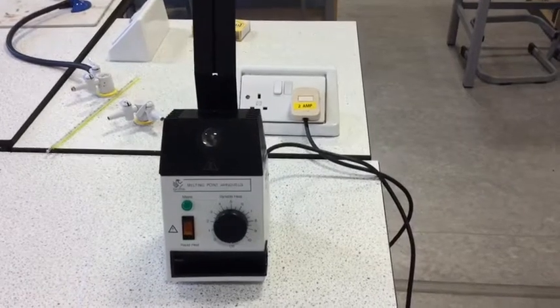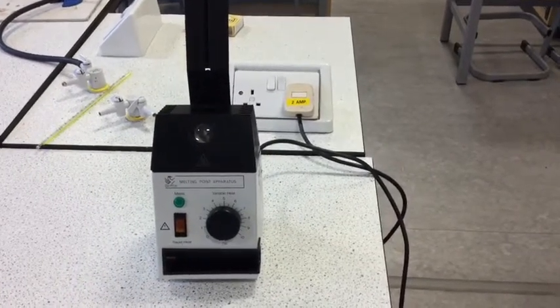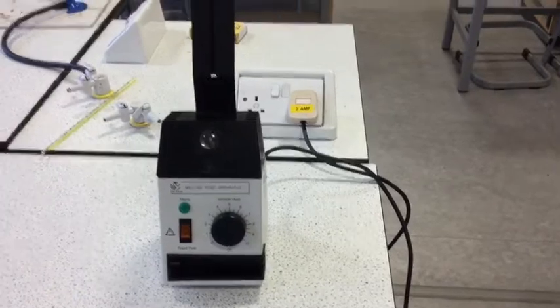This is the melting point apparatus. It's really just a big metal block with a heater. If you look at the top of the metal block, you can see there are four holes. In the big hole, we put a thermometer to record the temperature of the metal block, and the three small holes are for samples. We'll normally only use the middle hole and just do one sample at a time. However, at this stage we can use the melting point apparatus to check that we have sealed the capillary tube properly.